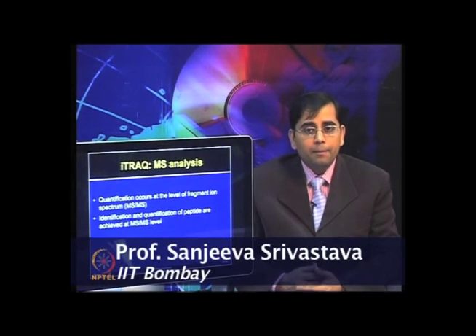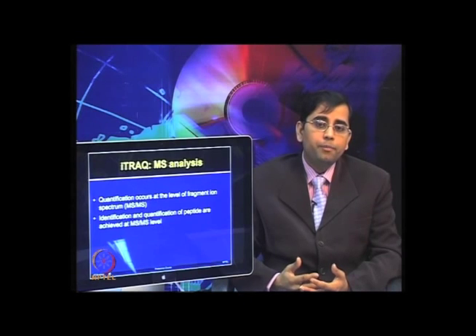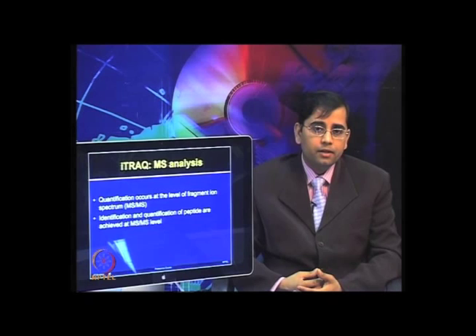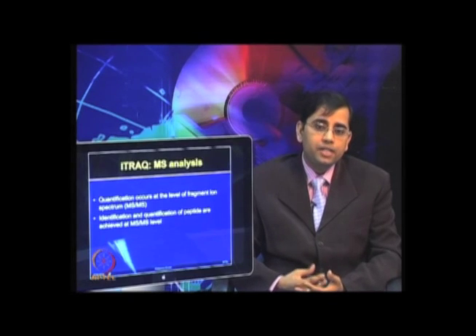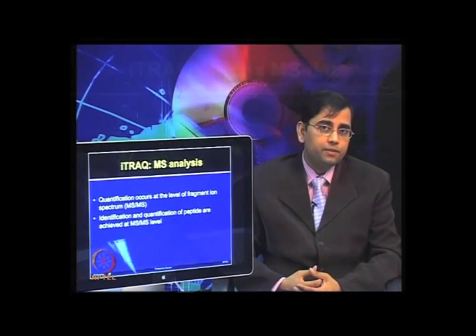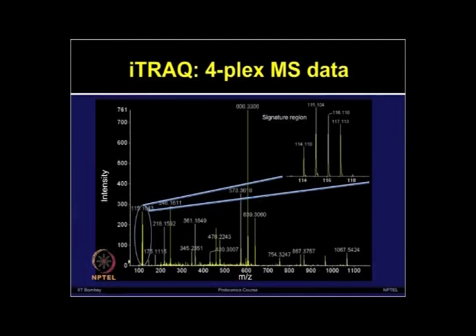The iTRAQ enables the quantitative protein profiling of multiplex samples without making MS spectra complicated. It reduces the redundancy in selecting MS precursor ions for collision-induced dissociation and enhances the efficiency of MS-MS analysis and peptide identification. So, this is a representative spectrum for the 4-plex iTRAQ experiment.